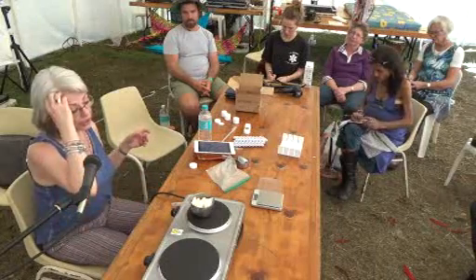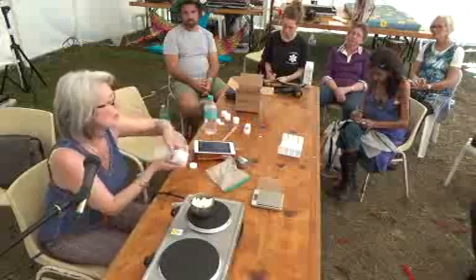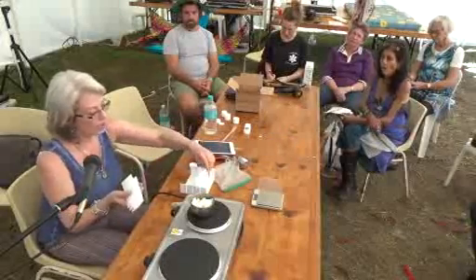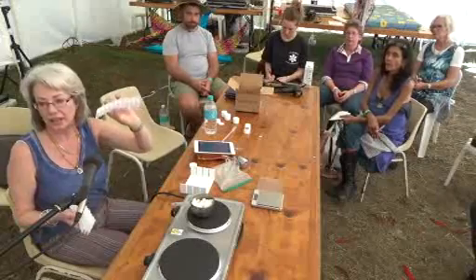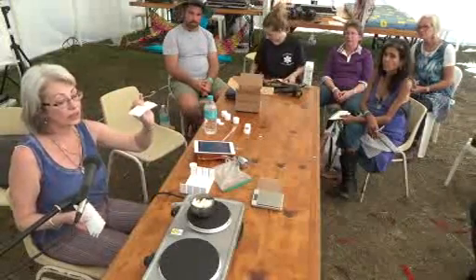So what I'm doing is I'm measuring out. I'm planning on making 50 suppositories today, so I'm measuring out 100. These are molds. I don't know if you can get them here. Yes, you can buy them on the internet. They're not that cheap, but they work really well.